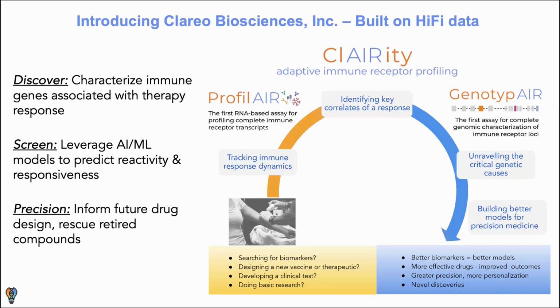And we are hopefully aiming to develop AI/ML algorithms to use this to develop predictive biomarker screens. And then, of course, our moonshot would be to use these data to inform pharma and other drug development companies on how to design drugs that have the most breadth across populations with the least amount of side effects.